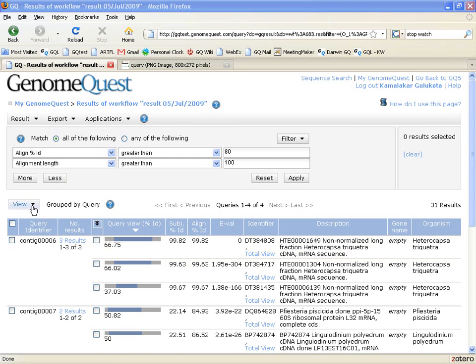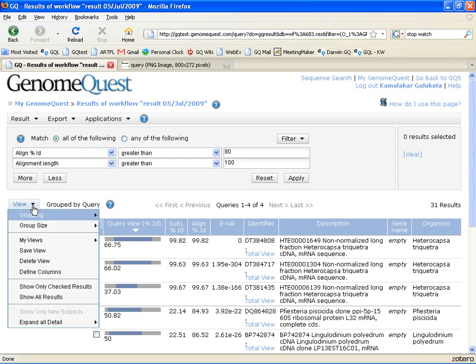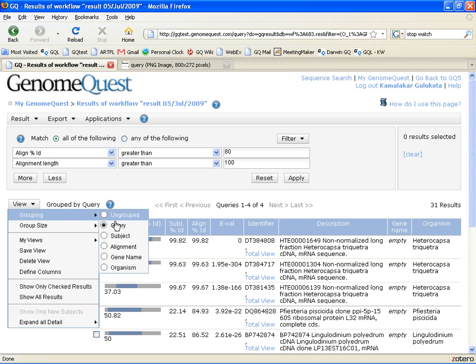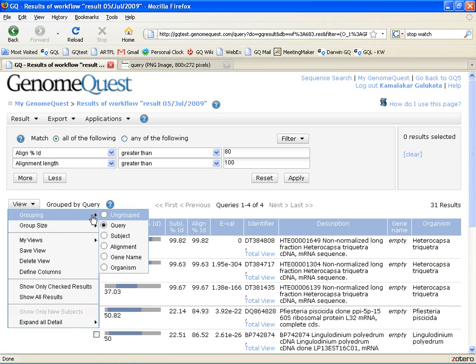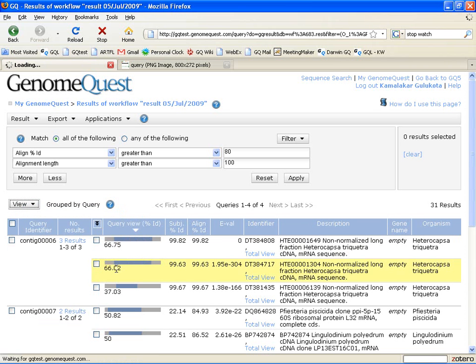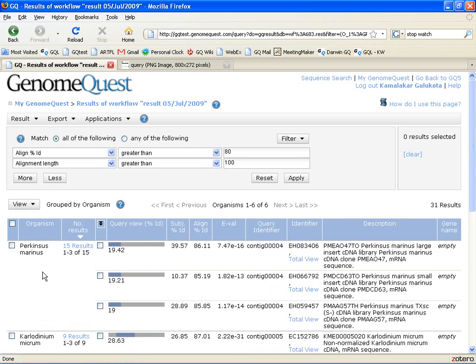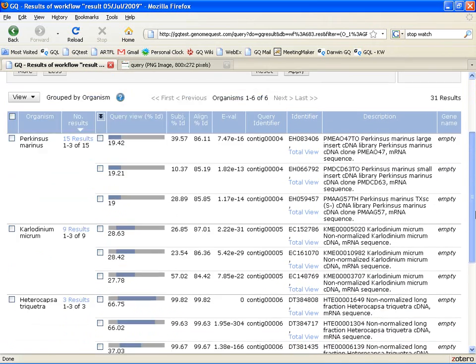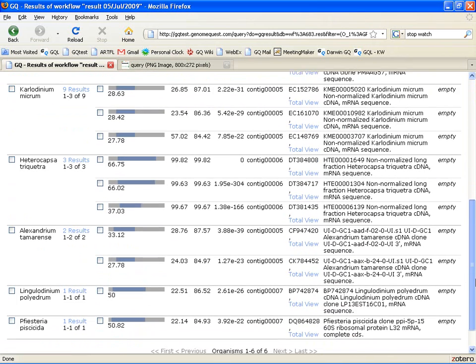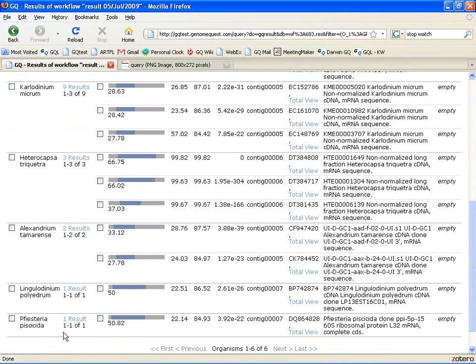You can actually do one more thing to get an overall view of the results and that is to group your results. In this case, for this environmental sample, I'd really like to know how many organisms are represented. So when I group my results by organism, I see that six organisms are represented in these 31 results and I can see what those six organisms are as well as how many results I have for each of those organisms.